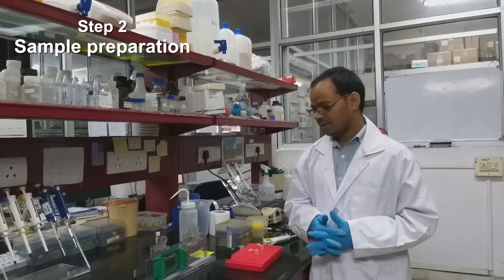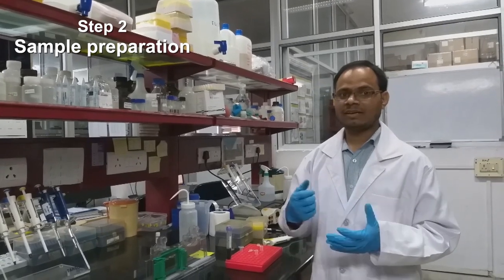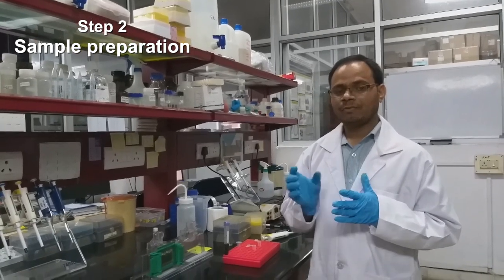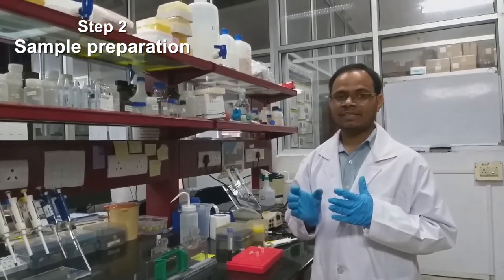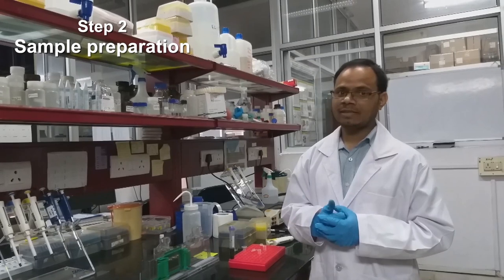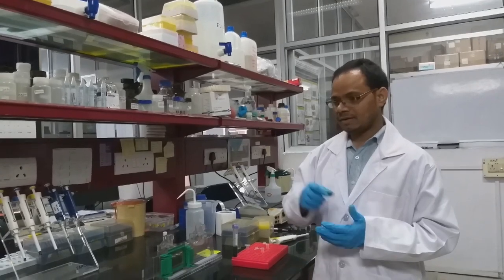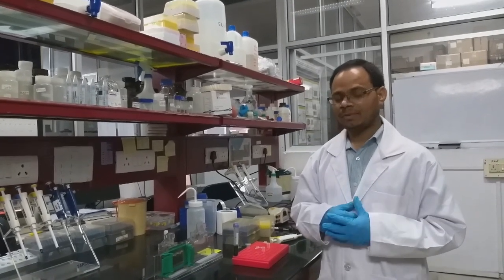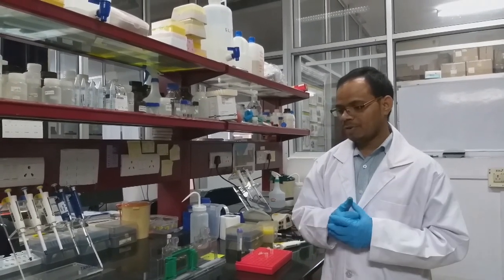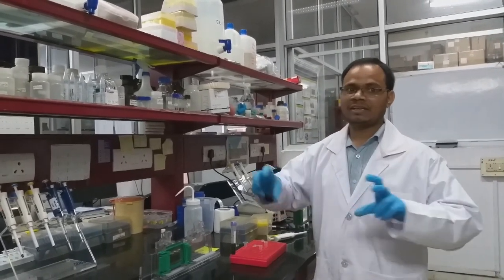The other thing is glycerol. While loading the gel, since the protein solution is not that dense, it may come out from the well. So in order to prevent this, we have to load with a denser solution like glycerol. So 30 to 50% glycerol is sufficient for keeping the protein solution intact at the bottom of the well. The other thing, bromophenol blue, we use just for tracking how much of the gel is completed.